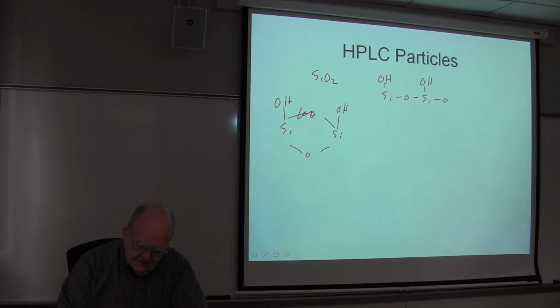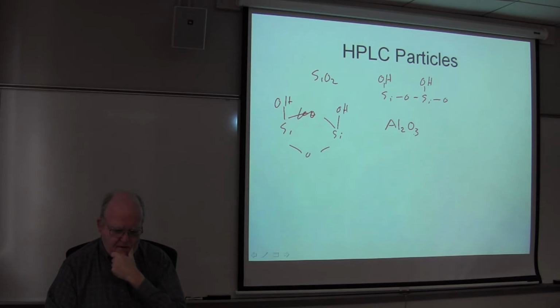Other common particles are alumina, zirconia, titania. Pretty inert stuff. And then synthetic organic polymers like polystyrene.